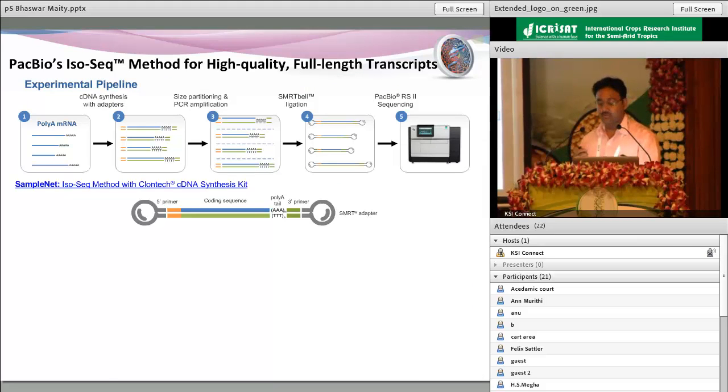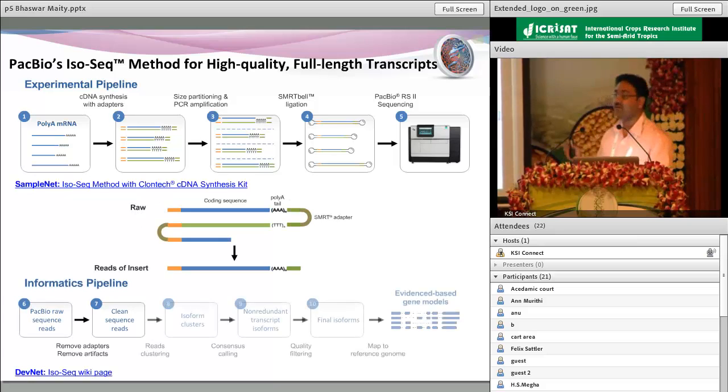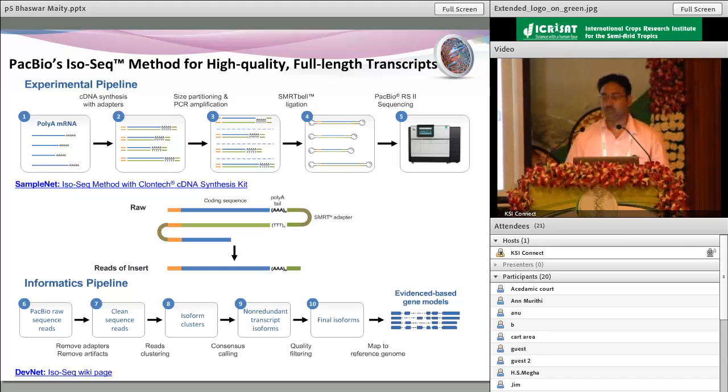The other way, when you do not know the genome information, is looking into full-length transcripts, which might give you an opportunity to discover new variations. You do not know the genome, and you do not have the ability to use a GBS-based approach, but if you pick up the full-length transcripts, it still gives you the opportunity to look at the variations in the functional genes. PacBio's technology, with the highest read length, will probably be able to cover most of the transcripts coming from the genome itself. It's a fantastic approach to genome variation discovery.